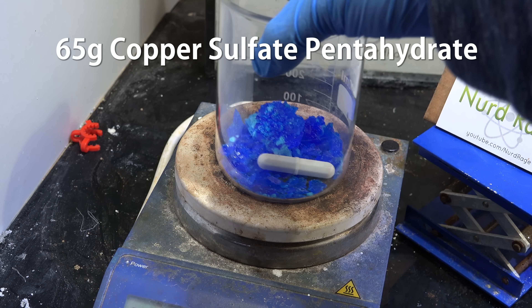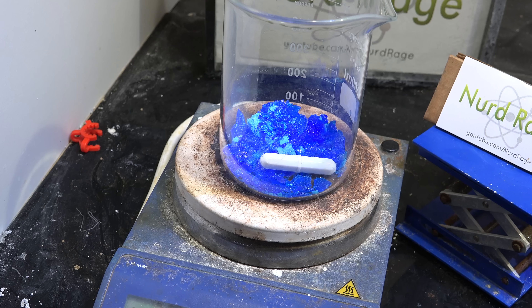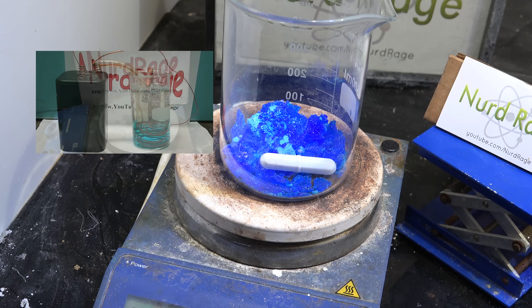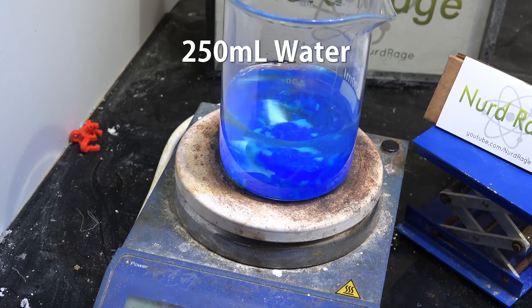We first start with 65g of copper sulfate pentahydrate. This can easily be bought as root killer or a pond algae control chemical in garden stores. You can also make some as I've shown in earlier videos. Now we add in 250mL of water and stir until dissolved.